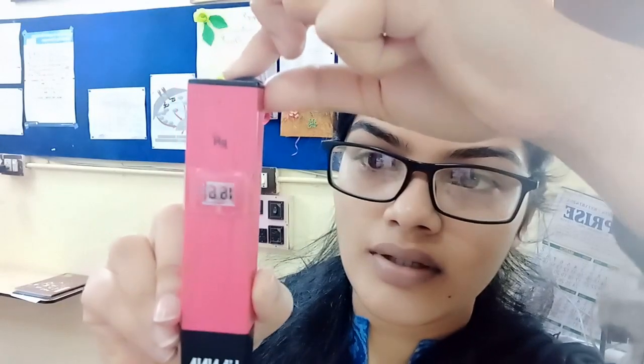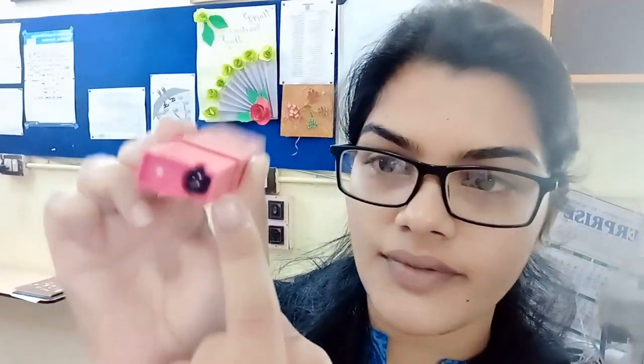So, this is a pH meter which has a display box, the switch to turn it on, and the probe which has sensors which go deep into the water.